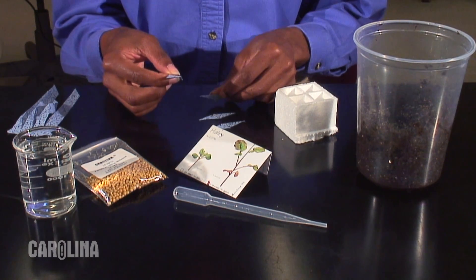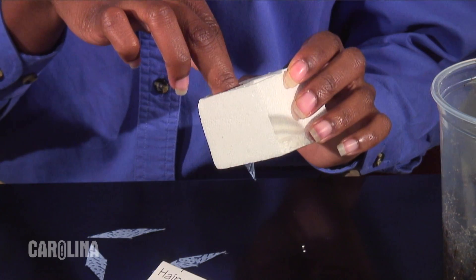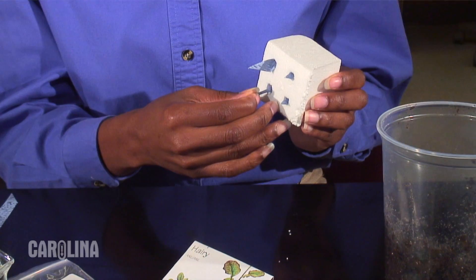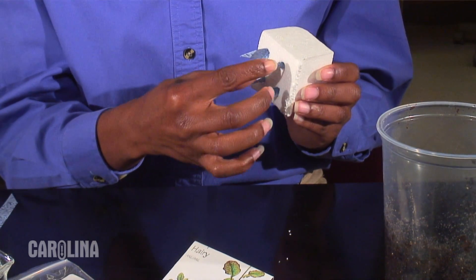Separate four wicks. Place a wick into each planting chamber of a quad. Be certain the wick comes through the hole in the bottom of the planting chamber.